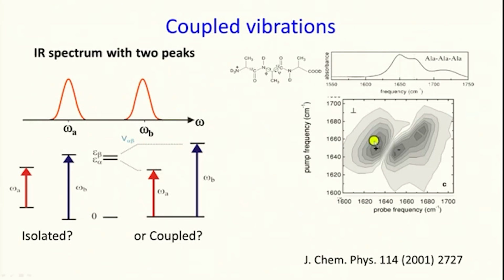And these contour lines represent hills. So, the contour line outside has the lowest magnitude, the point inside has the highest magnitude. As you go from out to in, you can get a hill or you can get a trough if the sign of the absorbance is negative. In this course at this stage we are familiar with negative absorbance. What we are really talking about is delta A. As we know, for ground state bleach and for stimulated emission you actually get negative delta A signals. So, depending on that, it is usually color coded to show whether it is plus or minus, and then you get contour lines like this to represent the 3-dimensional surfaces.